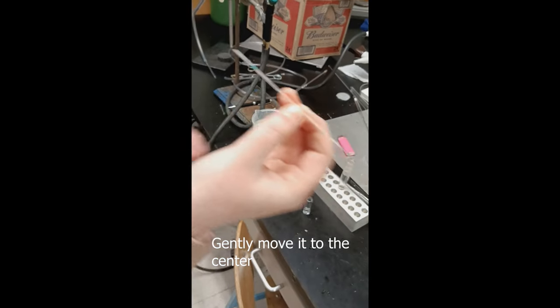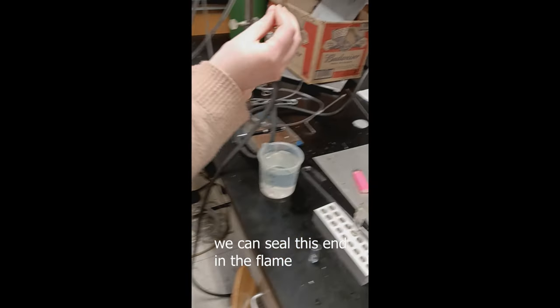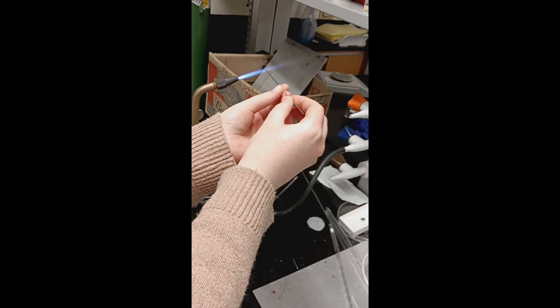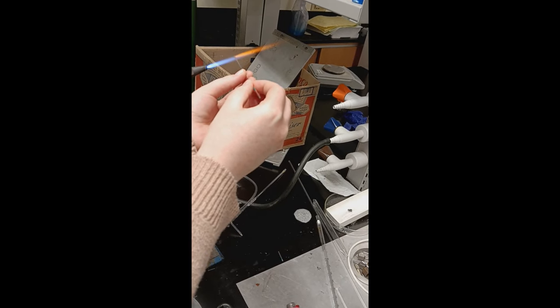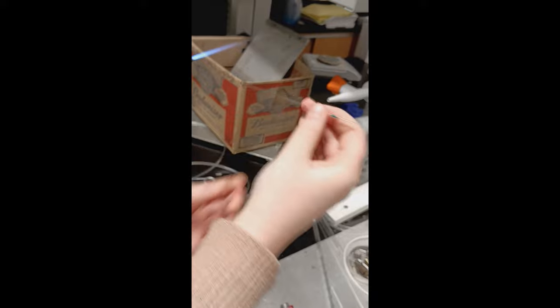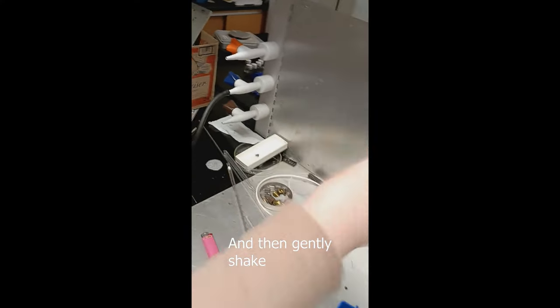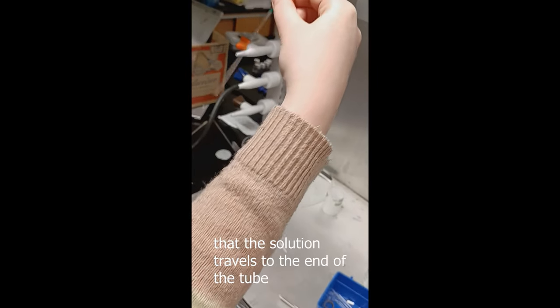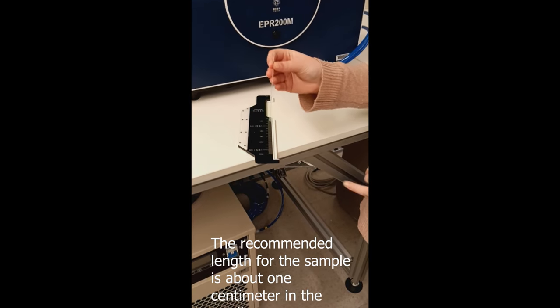Gently move it to the center. And once it's there, we can seal this end in the flame. And then gently shake so that the solution travels to the end of the tube. The recommended length for the sample is about one centimeter in the capillary.